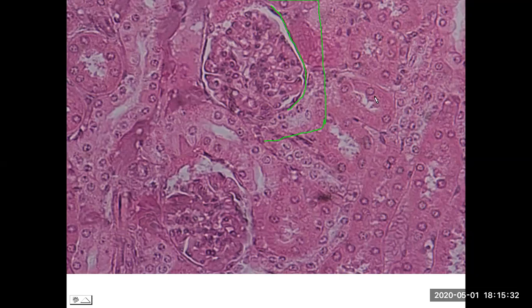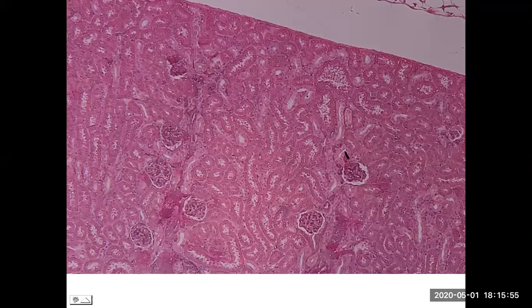And now surrounding it, we see all these other tubes here, all these other rings. And we don't have to be specific, as the lab manual says. These are just some type of convoluted tubule. So either proximal or distal, and we don't have to differentiate between them. So whereas the cortex has the defining trait of renal corpuscles, when we move deeper into the medulla, and that's the area here, the medulla lacks any renal corpuscles.